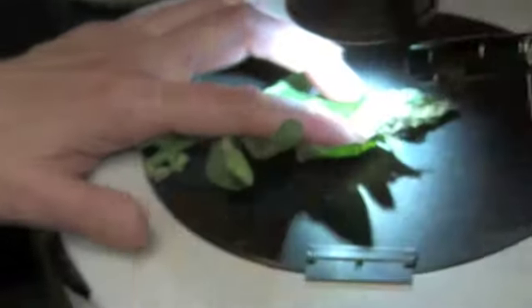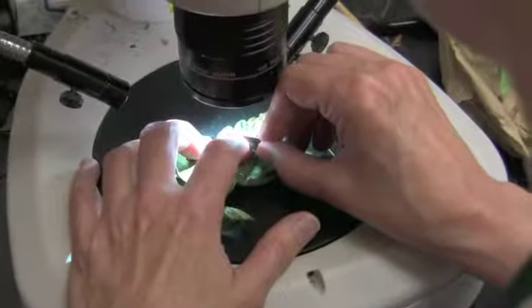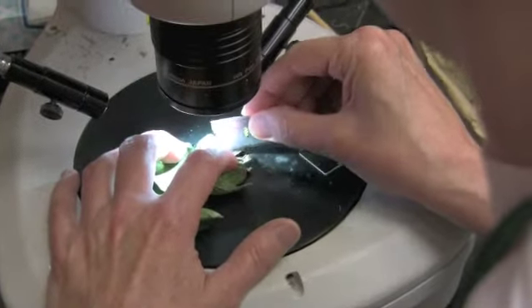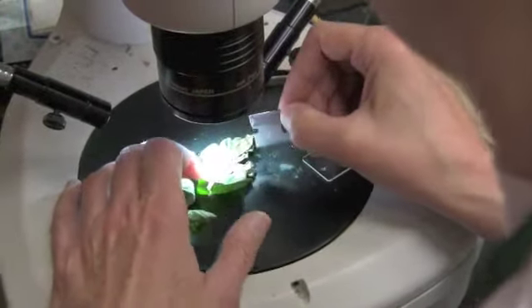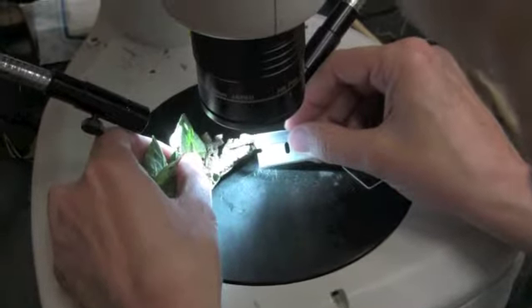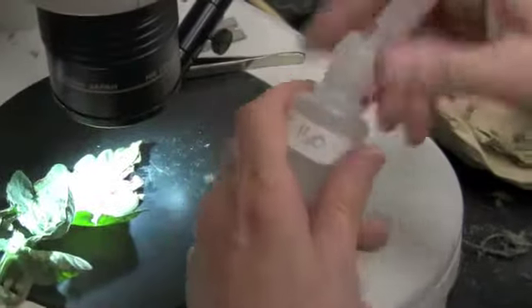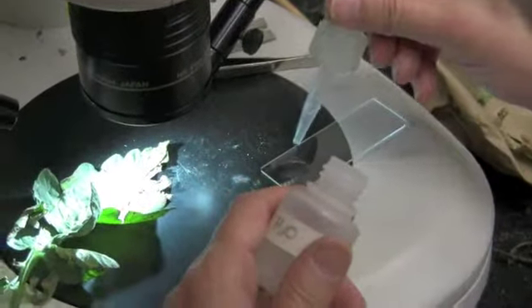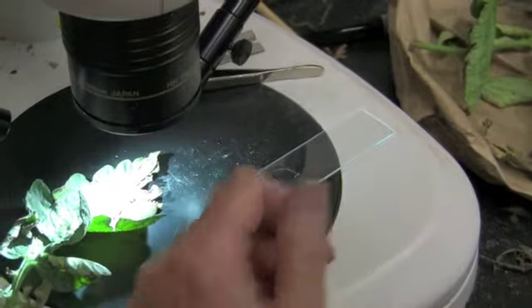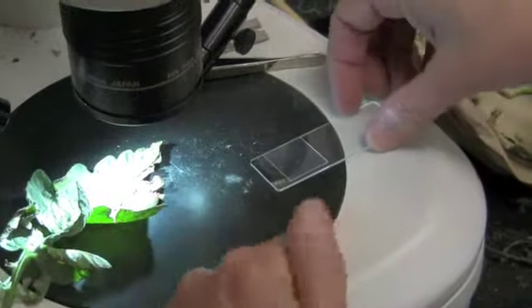So the next thing I'm going to do is check for bacteria using a higher level of magnification. So the first thing I'm going to do here, Bob, is take a small cross-section of a very tiny piece of the tissue, which just fell out on the bottom of the tray, and look for bacterial streaming out of that, which is definitive for identification of a bacterial disease, but it's not definitive for which bacterial disease.